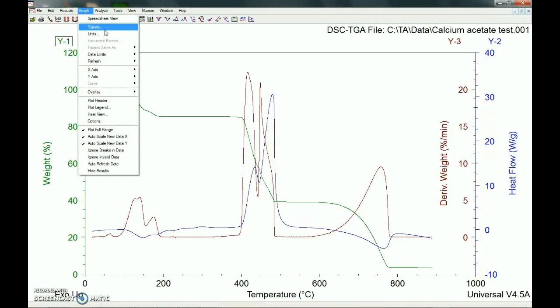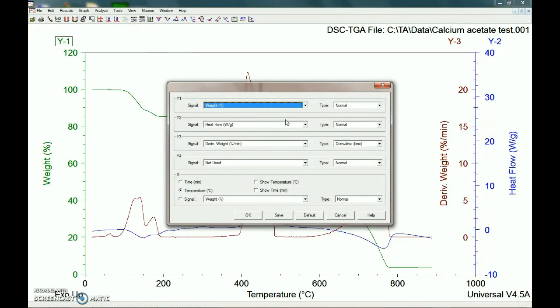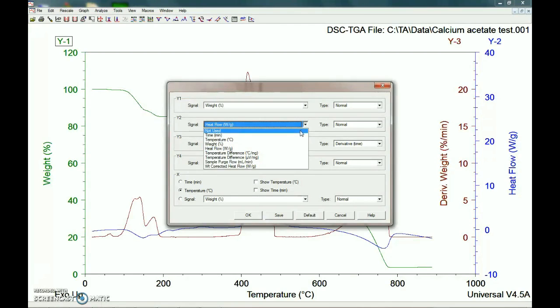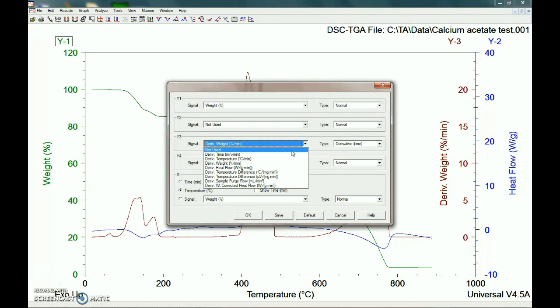So the one we're really interested in is the weight percent versus temperature. So go up to graph and signals. And we can just go ahead and get rid of these other ones here. The data is still there, but we're just making it so that the graph will only display the things we want here, which is weight percent on the y and temperature on the x. So hit OK.